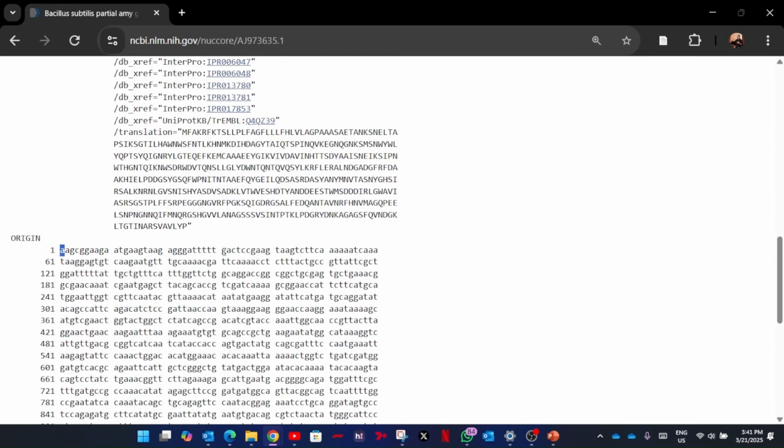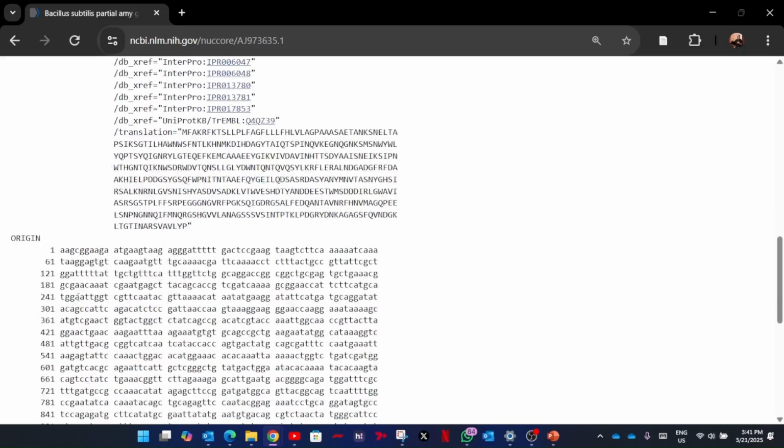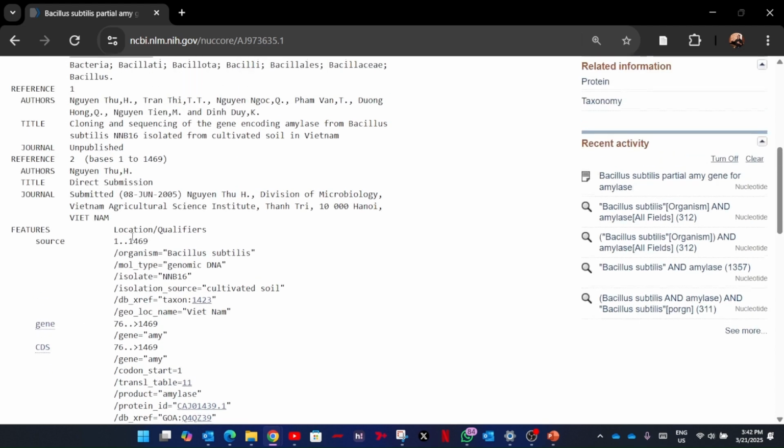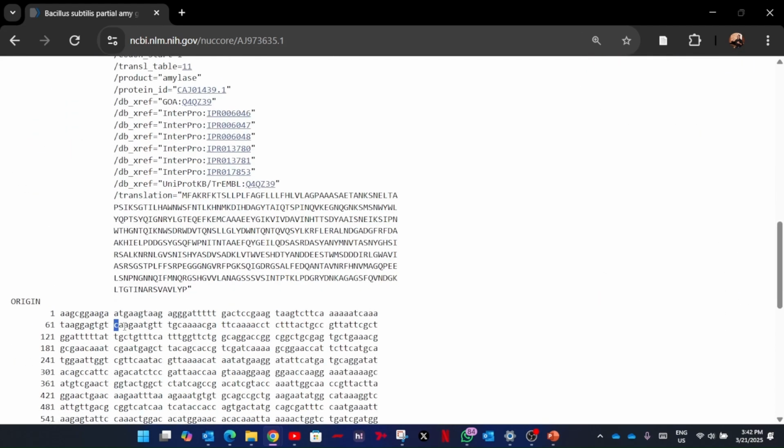Now what else do we come to know from this? It says the actual gene starts from the 76th position. So this is 60th, so the 61st, 71st, and here it says 76th: 71, 72, 73, 74, 75, and 76.